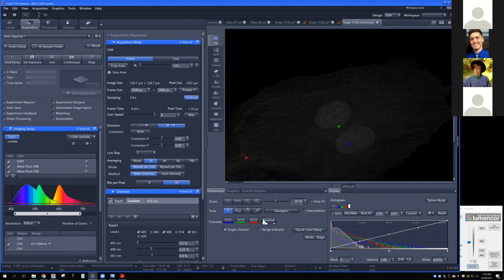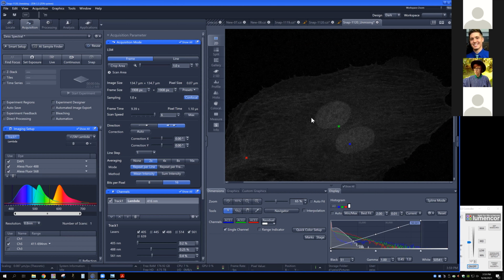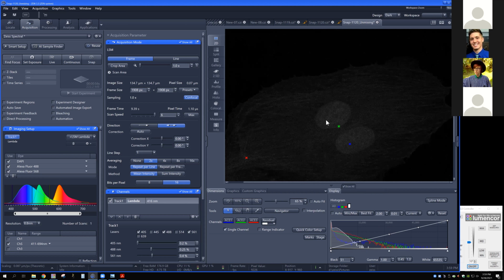This residual channel is showing you basically what's left over once you finish doing this entire unmixing process. And so what you want to see, you don't want to see a lot of signal. So what we're seeing here is fine. What you want to see is just a small component of each one of these. If any one of your signals overwhelms the rest of them, it generally means that that fingerprint wasn't very good when you did the unmixing. But it did a decent enough job.